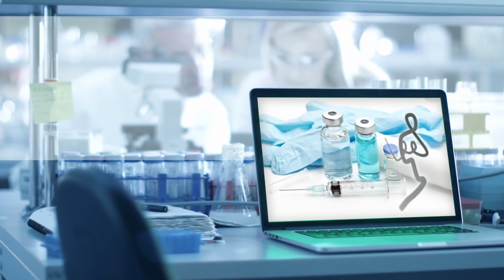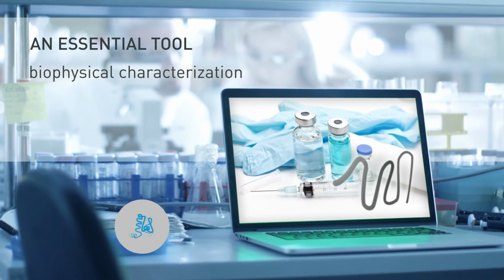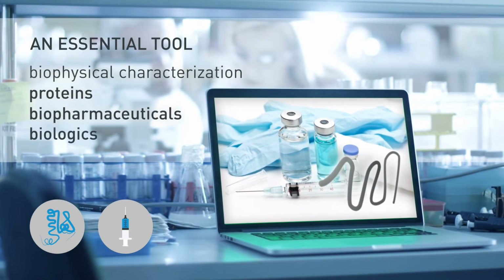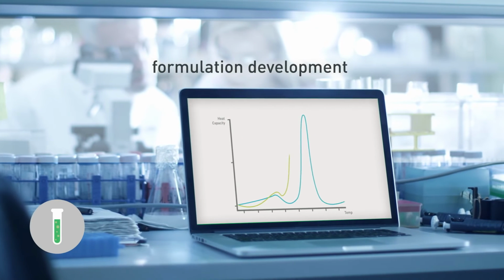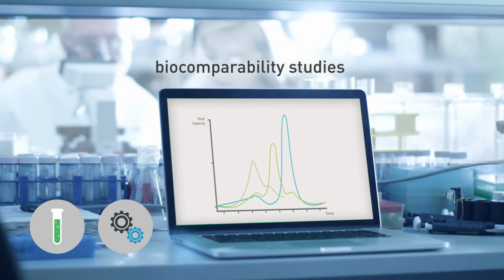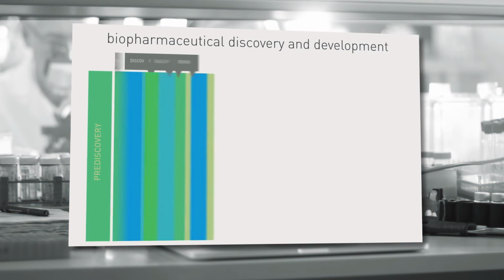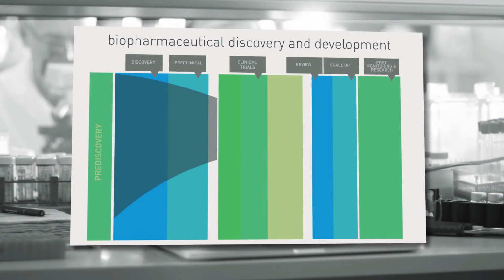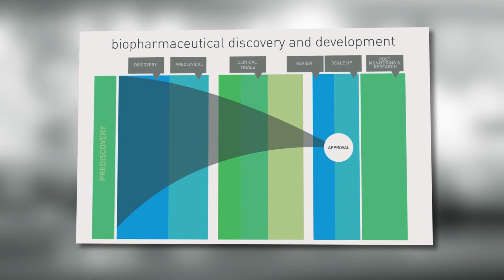Thermal stability data from DSC is an essential tool in the biophysical characterization of proteins and biopharmaceuticals, during protein engineering, formulation development, and biocomparability studies. Since DSC is the gold standard TM assay, the technique is an essential stability screen in biopharmaceutical discovery and development.